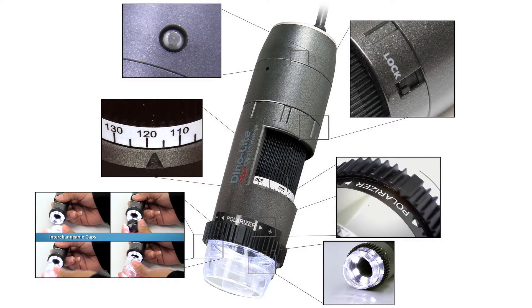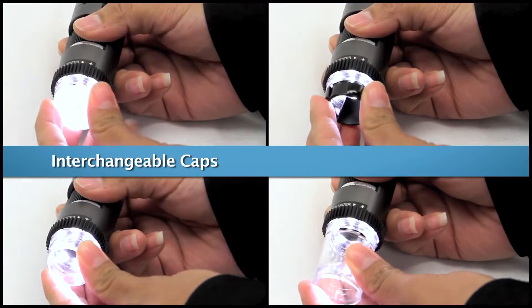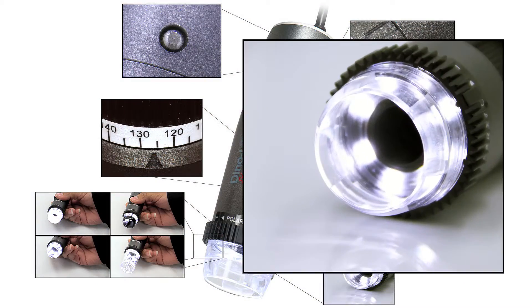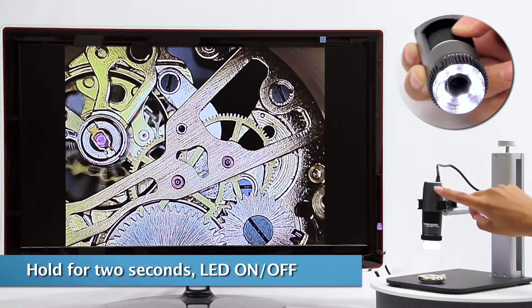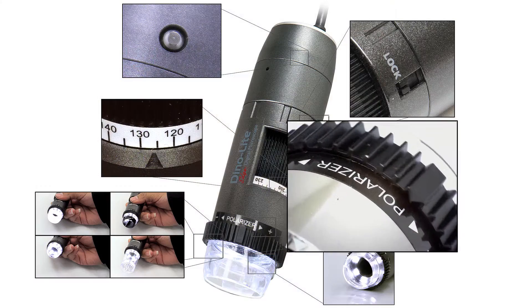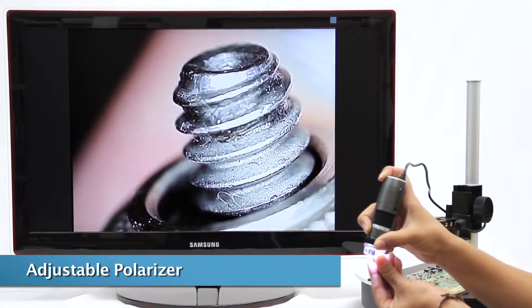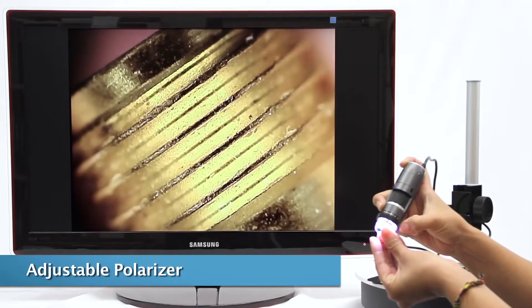Here are some of the hardware features. Included are various interchangeable caps that increase viewing options and effectiveness. The Microtouch button controls the 8 LED lights. The built-on adjustable polarizer provides more clarity and reduces glare on reflective surfaces.